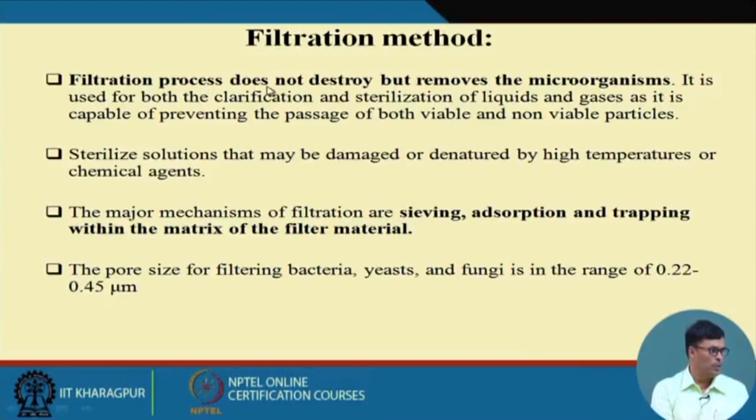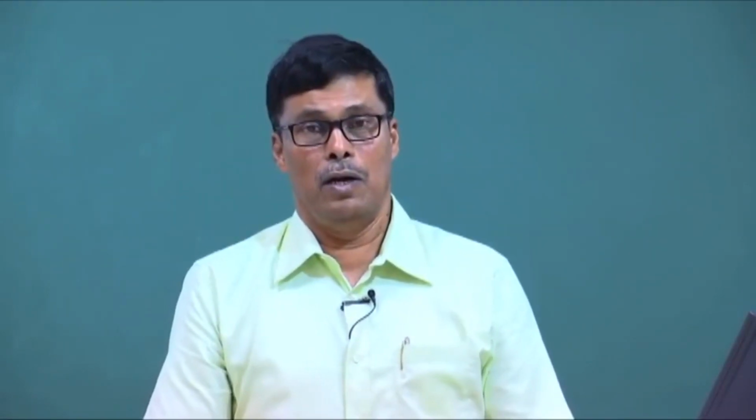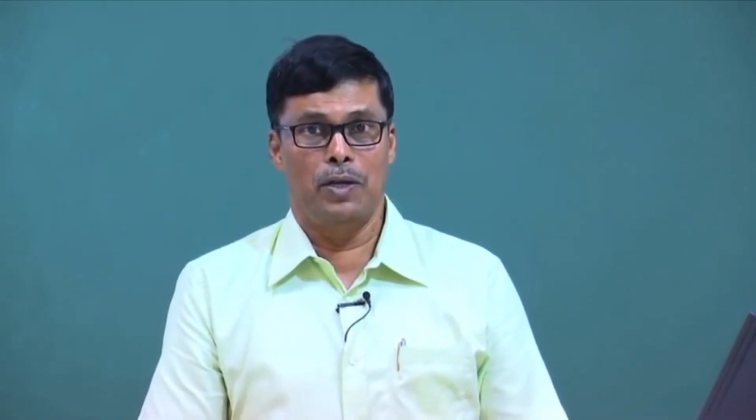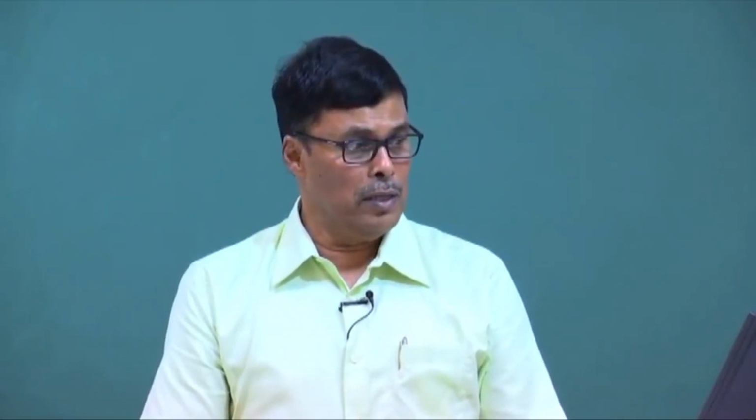Filtration process does not destroy but removes the microorganisms. That is why I told you that in case of heat sensitive material we use that, but this is a very costly process. And when you talk about the biochemical industry, we have two types of products. One is called high value products and another is low value products. High value products means the per unit cost of the product is very high. Because the per unit cost is very high, there we can think of this kind of technique where high cost involvement is there.